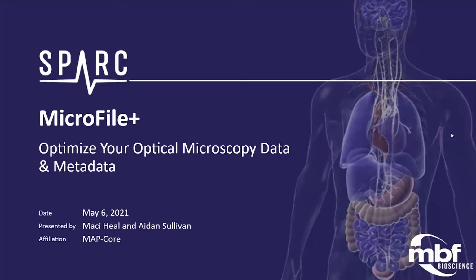And for new visitors and those who are outside the SPARC program, we welcome you too. Though we'll be discussing a SPARC-specific application of MicroFile Plus today, the tool is freely available for download, and we encourage you to employ the powerful utility in your image analysis and data sharing workflows.